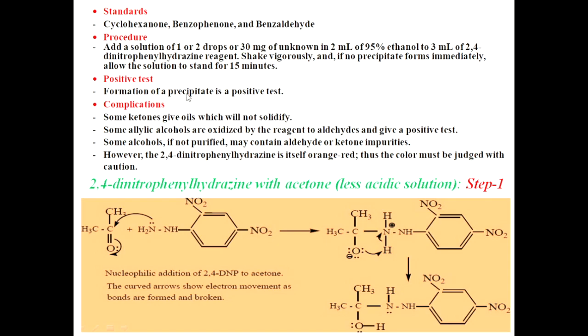The formation of a precipitate is a positive test, which confirms the presence of either cyclohexanone, benzophenone, benzaldehyde or any aldehyde or ketone. Now there are complications also. Sometimes some ketones give an oil which will not solidify. If you go to the higher carbonyl compounds, they will not give solids, but they will give colored oily compounds. This is a limitation.